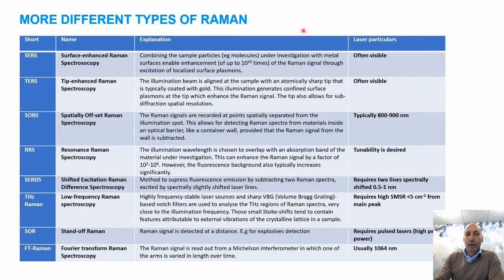And if that was not enough, there is a wide range of sub-variations of Raman spectroscopy that also put slightly different requirements on the laser source. Most of these are sub-variations to microscopy, but not all of them.